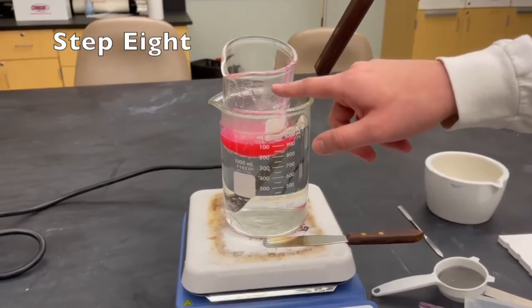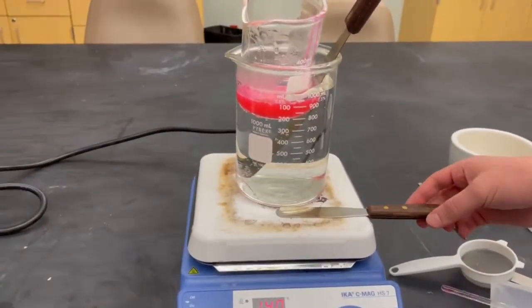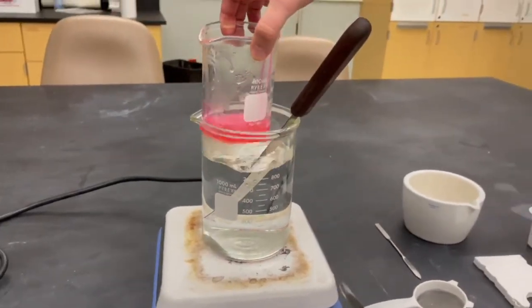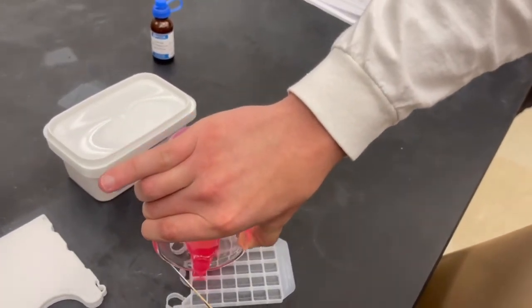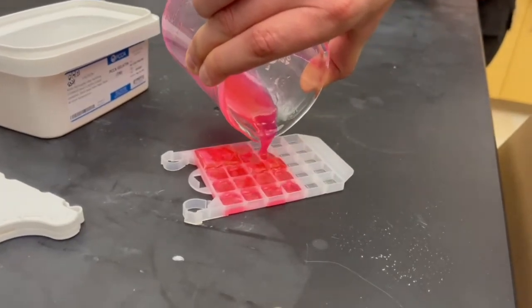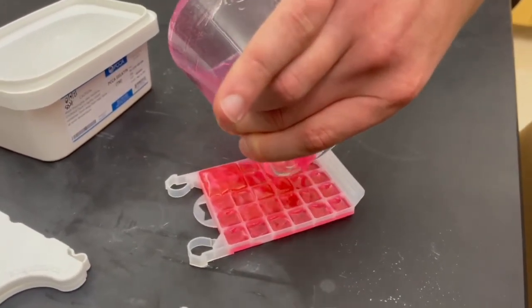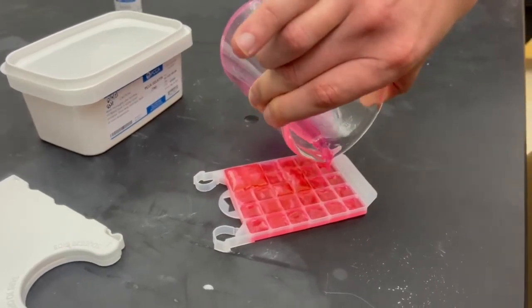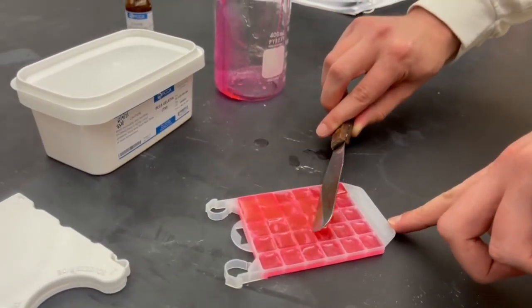For the next step, we're going to pour our product into the troche plate, and then you're going to want to smooth over any excess with a warm knife. So if you heat up the knife on the hot plate for 20 seconds or so, it should work pretty well. And then now we're going to pour. Those are pretty full, and so then you're going to take your warm edge and slide over all of them.